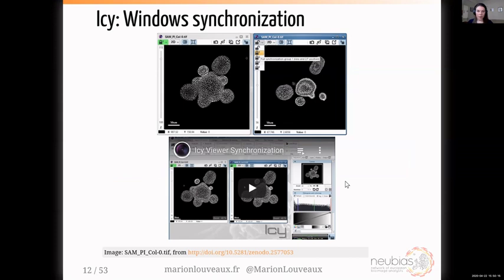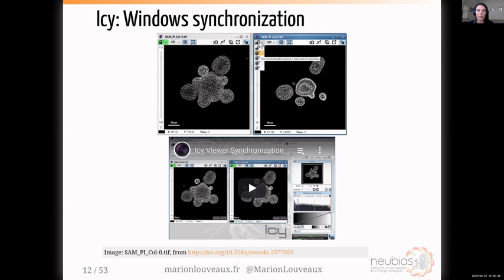I want to show you a nice feature of ICY: you can synchronize windows. It's particularly interesting when you want to compare two channels. In the upper left corner of the viewer you have a lock icon — select group one on both windows and this will synchronize them. I put some videos on the ICY bioimaging YouTube channel so you can find these videos afterwards.